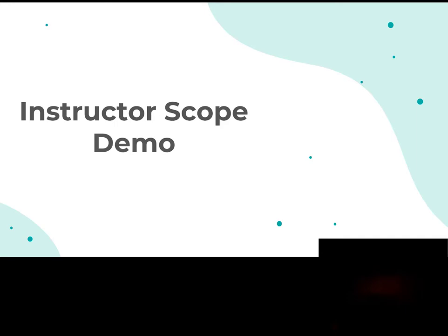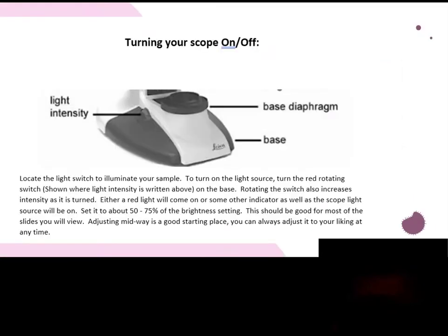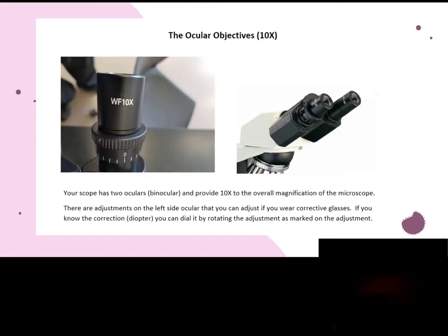Now for the instructor demo. I'm going to look at the stage and the objective lenses. The Lydic scopes we use at Wake Tech are really nice. Mine is one I got off eBay — a $300 scope I got for about $150. If you're looking for a scope, you want one with a revolving nosepiece and at least three to four objectives, which shows the quality class of the microscope. Also look for parfocal capability — I'll explain what that means.